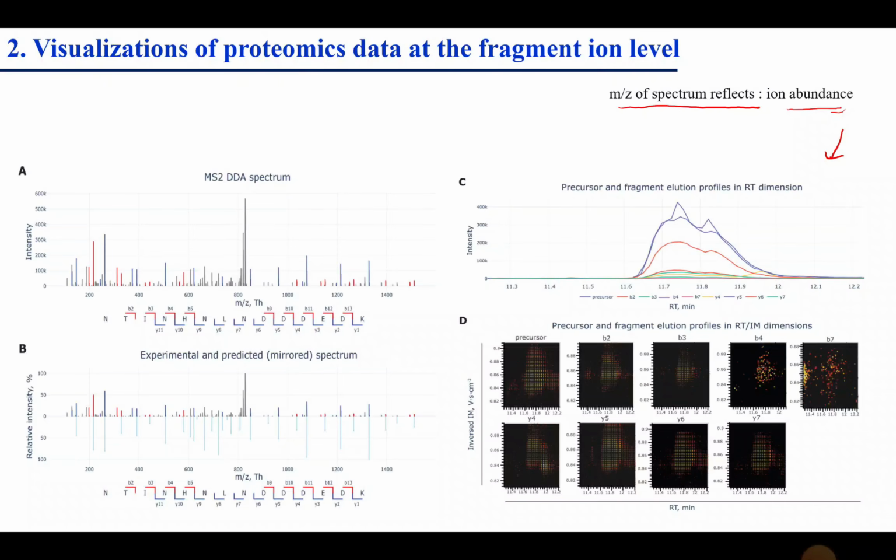And here it is important to know that we are discarding a few peaks, and we are keeping a few peaks of the ion profile. So how do we achieve this? Here in blue color we have the precursor, which is matching with the sequence of Y5. How do we achieve this? We compare this ion profile with the help of online databases.